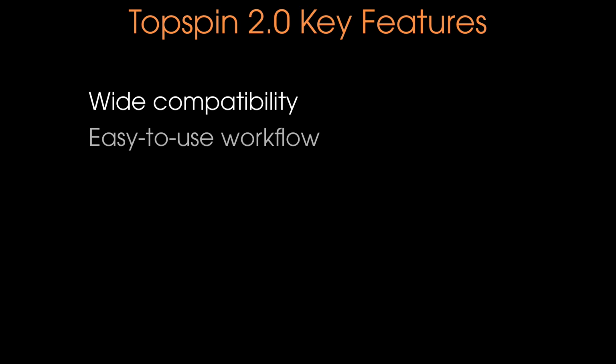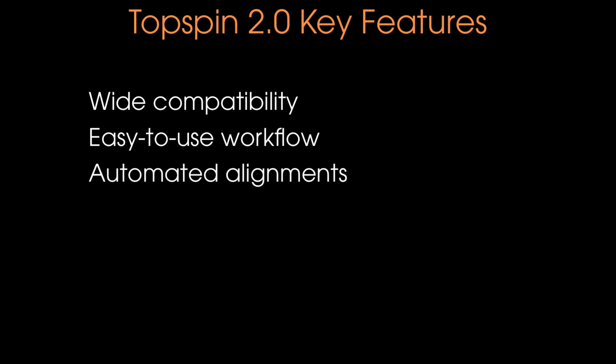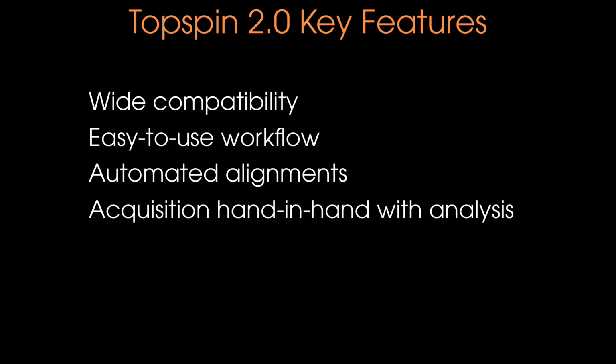Some key features of Topspin strain include compatibility with a wide variety of TEM systems, an easy-to-use workflow that guides the user through data acquisition, automated alignments to assist proper setup of the TEM, and full integration between data acquisition and analysis.